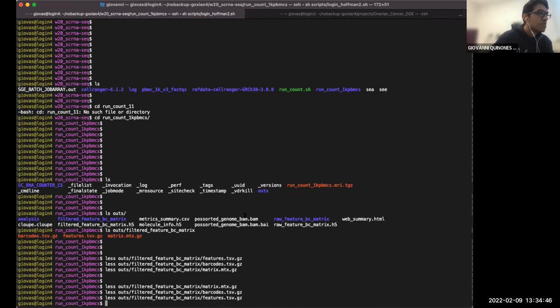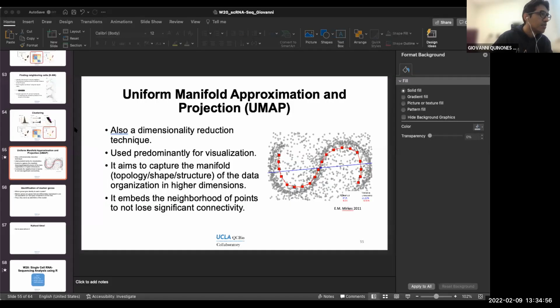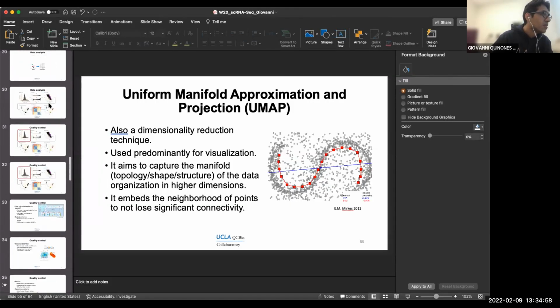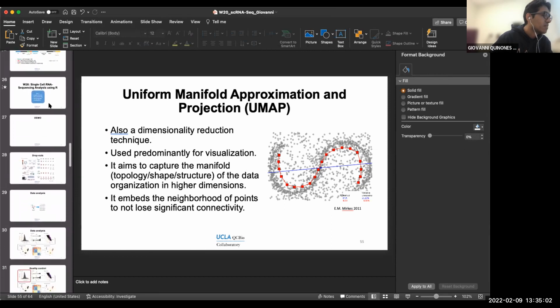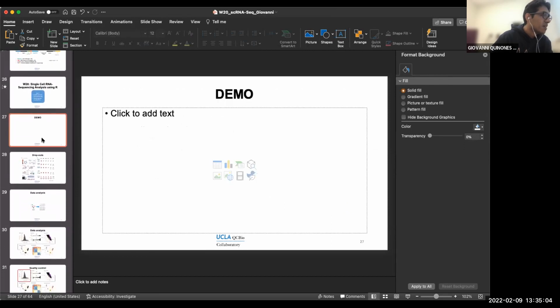So I'm going to switch back to the slides. Let me change my screen. Let's go back to where I left off yesterday. Here, the demo.